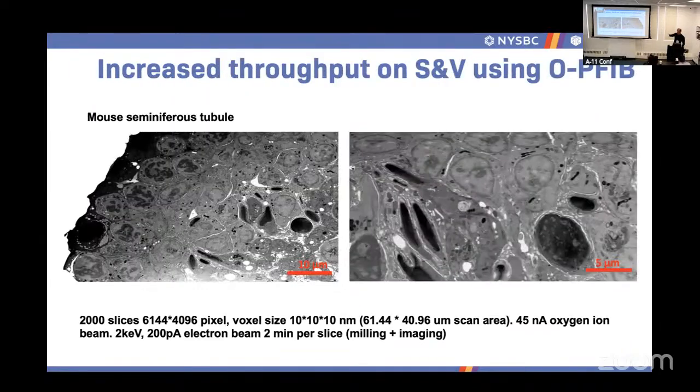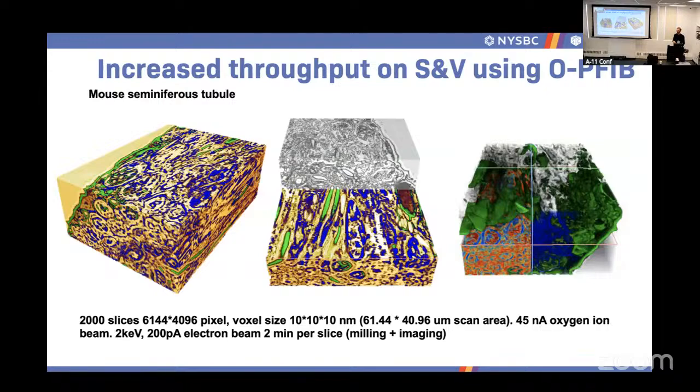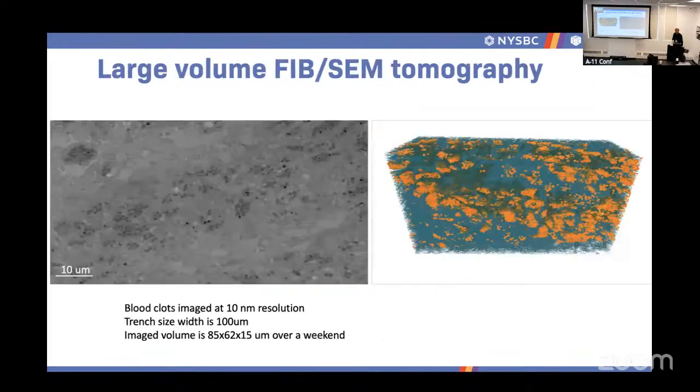You can get tons and tons of data, tons and tons of context. Just choose. I'm not saying don't do cryo in general, but choose your problem and choose your technique. Because a lot of people tend to go into cryo because it's cool, but then they get nothing out of 3 years of work. So maybe just pick your battles. If your sample cannot be changed, maybe stick to resin. There's nothing wrong with it. These were just examples of hundreds of micrometer cube of sample.